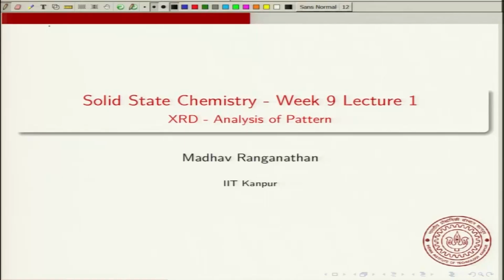Now, I will start the 9th week of this course. In this week, I will continue the discussion on X-ray diffraction that we started in the last week, and we will complete the discussion on X-ray diffraction, X-ray crystallography and electron microscopy. So, I'll first continue where we left off with X-ray diffraction, and we will see how to analyze the diffraction patterns. So, in this first lecture of week 9, we are going to do analysis of XRD patterns.